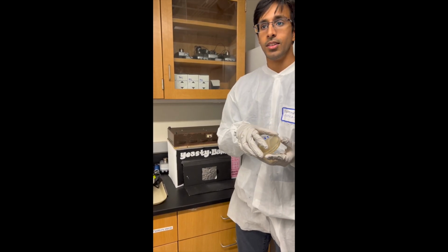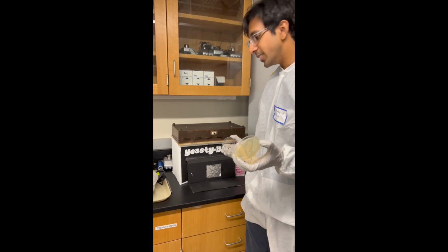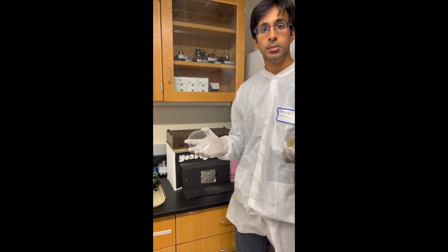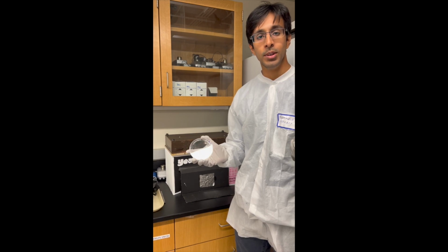Now that the cells are on the plate, even if they're too small to see, we can expose them to high-energy UV radiation, which damages the DNA and randomly induces mutation in the cells. This is how we reliably generate mutant yeast cells.